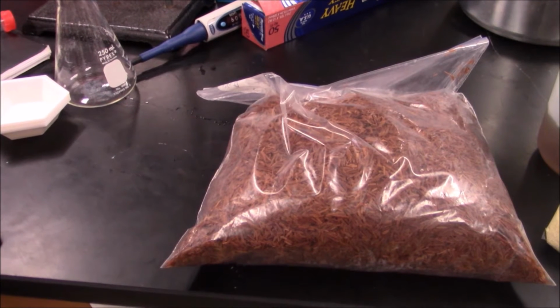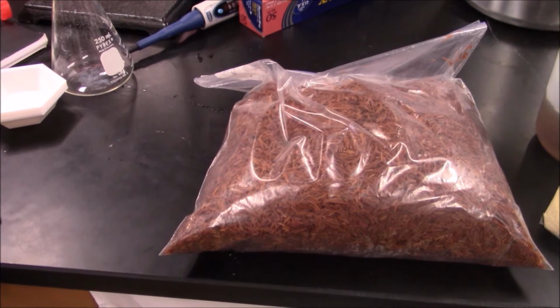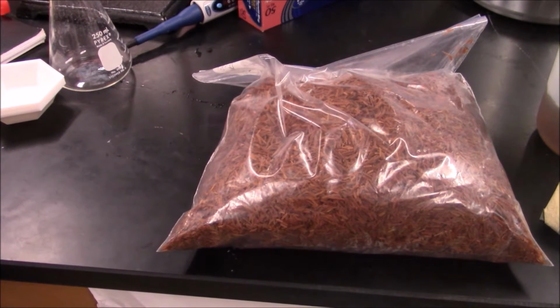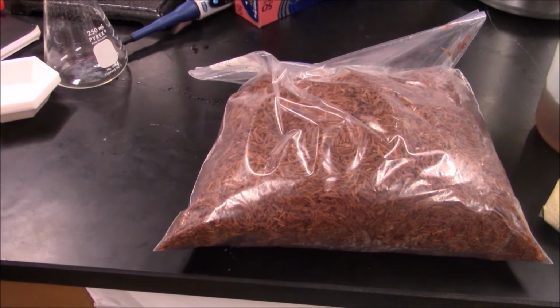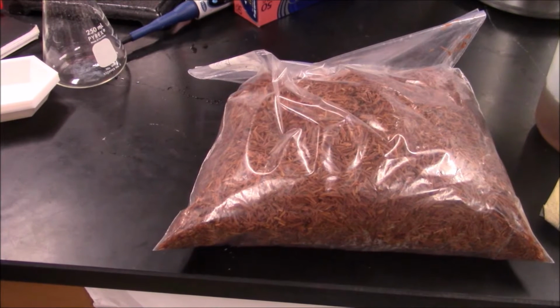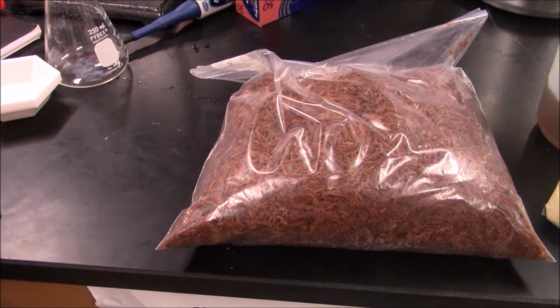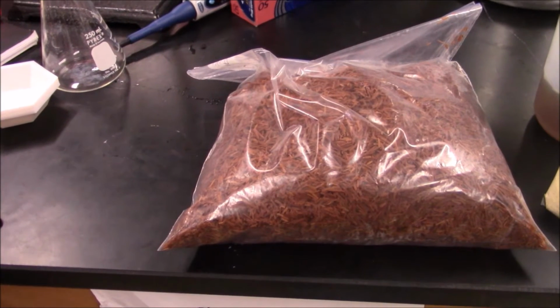The procedure for this experiment is similar to that followed in actual biofuel production, in that ethanol is actually being produced from pre-treated aspen wood chips. Since enzymatic hydrolysis and fermentation are taking place simultaneously during this experiment, glucose is being both produced and consumed. This means that glucose measurements need not be taken.